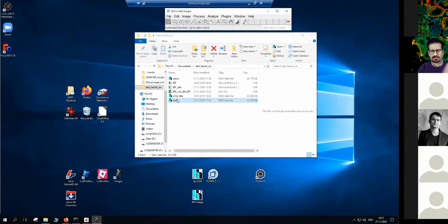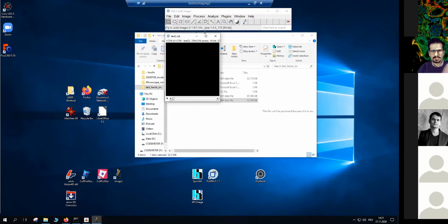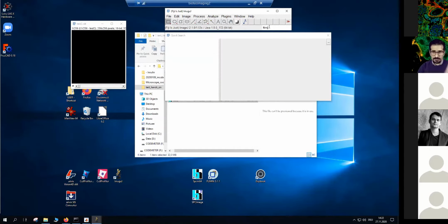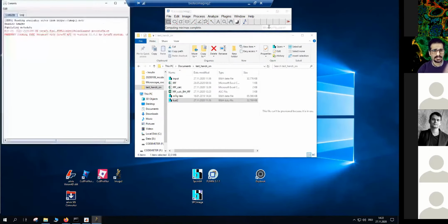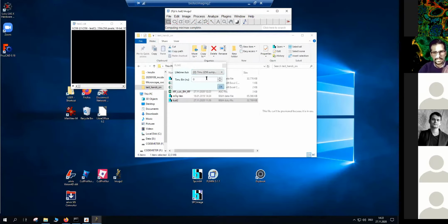Anyhow, so let's try it again. Opening the data, and then I just go directly to FLIM-J. Okay, so many warnings. So let it be. Let's put it at... See, that's the point.